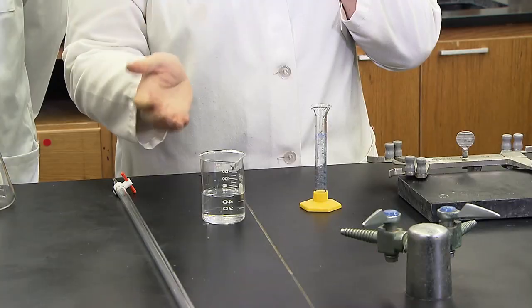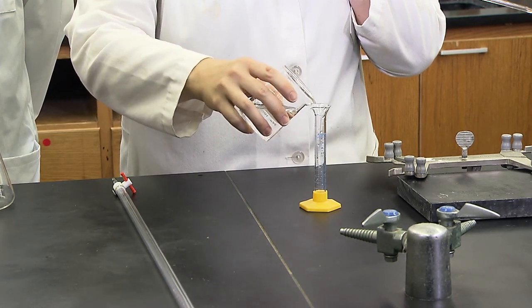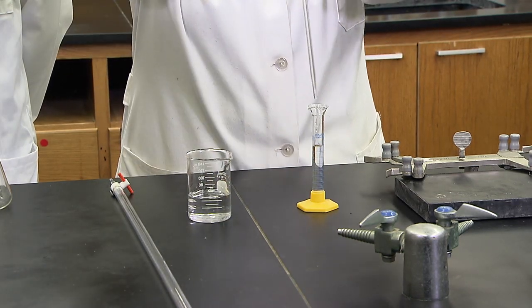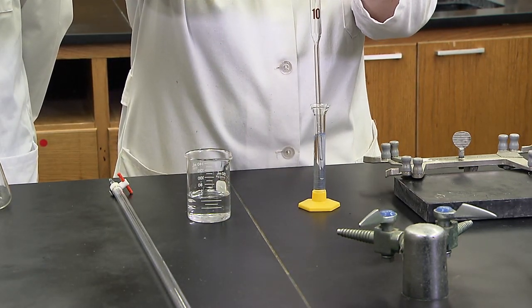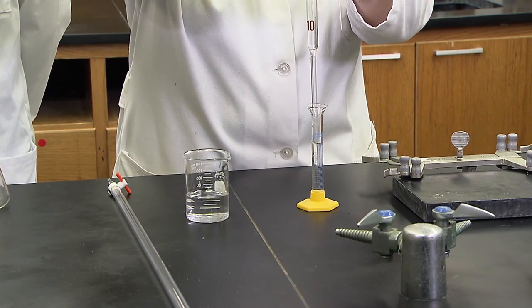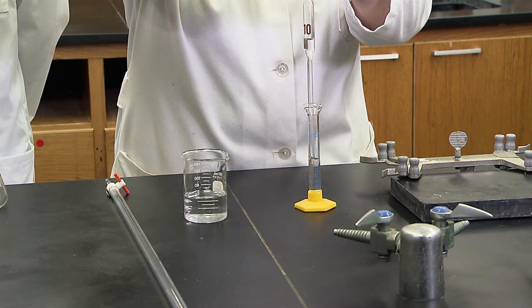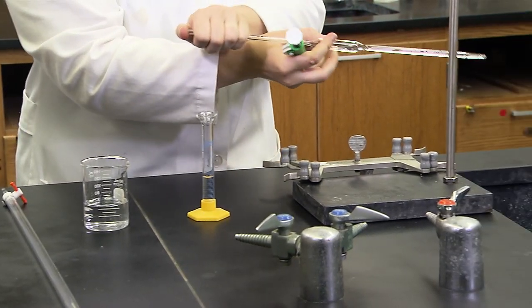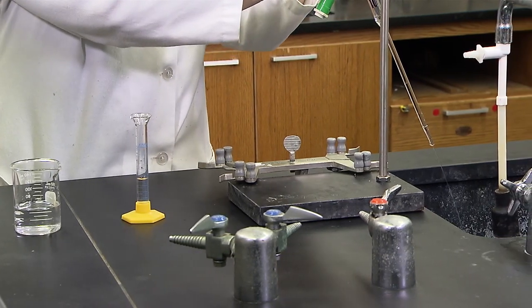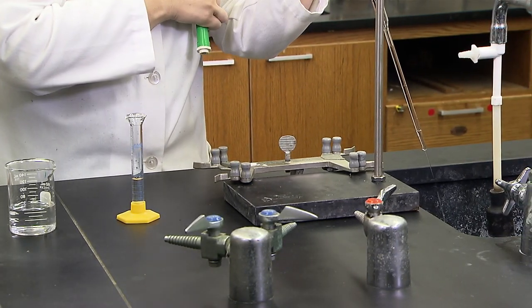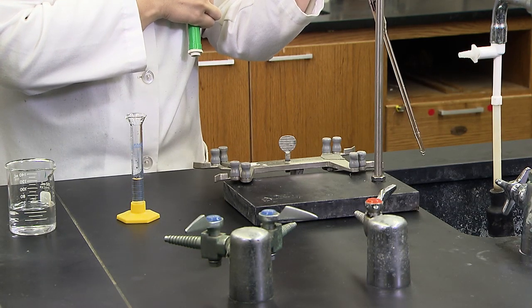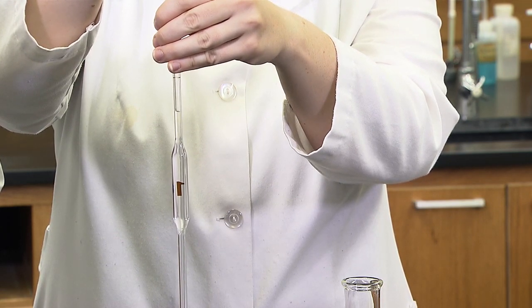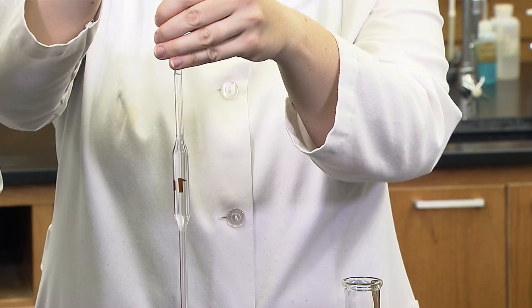There is enough sulfuric acid solution in this beaker for all the trials of this experiment. A little is used to condition the pipette. Remember to handle acids with care. Now, measure the 10.00 milliliters of sulfuric acid solution into the clean reaction flask.